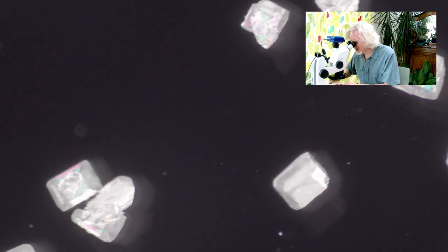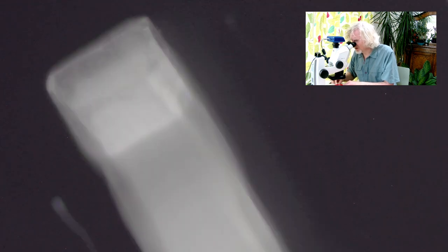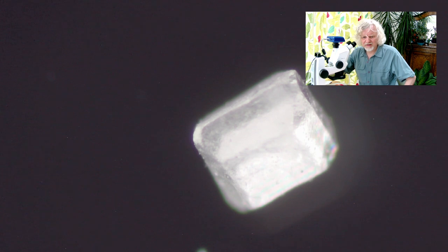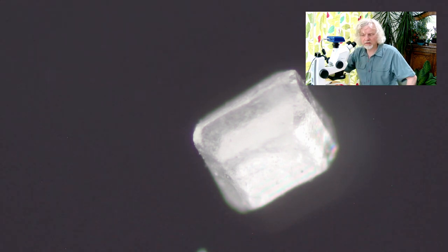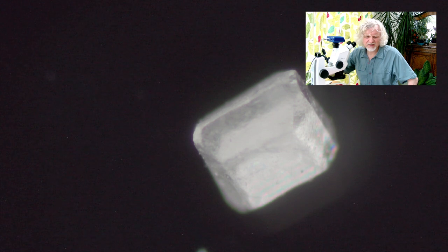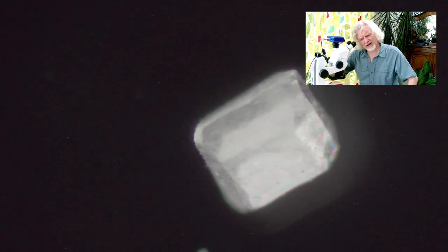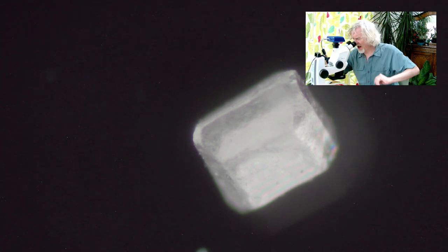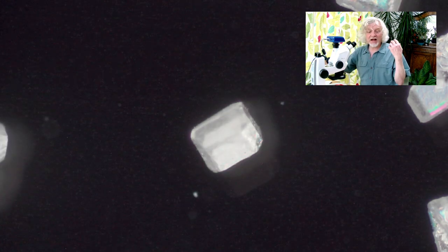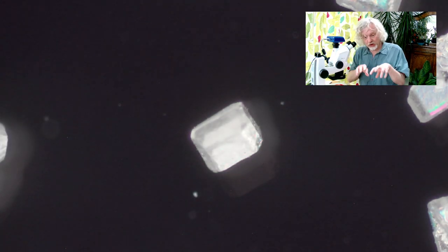There, that's quite good. So if we look at this crystal here. Can you see that it's not, oops, not in the center of the screen, sorry. I need to look at me. I'm going to turn the brightness down a little bit and then focus on that. And you can see it's not a perfect square. It's kind of got all these funky angles on it. And that's because of the chemical structure of the two substances.